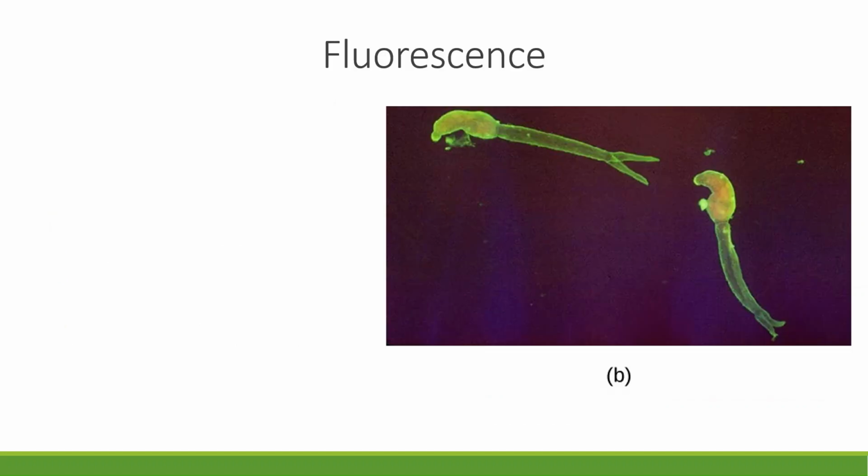Another fun type of microscopy is fluorescence microscopy. And this again uses visible light, sometimes even all the way to those really short wavelengths, which are called ultraviolet or UV light. So that would be a little bit smaller of a wavelength than the violet we're able to pick up with our own eyes.